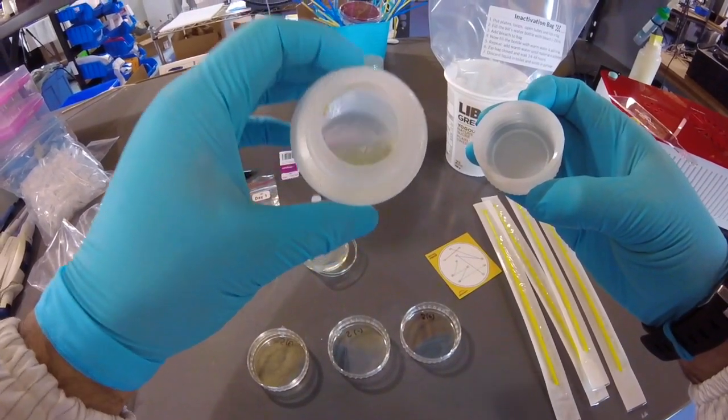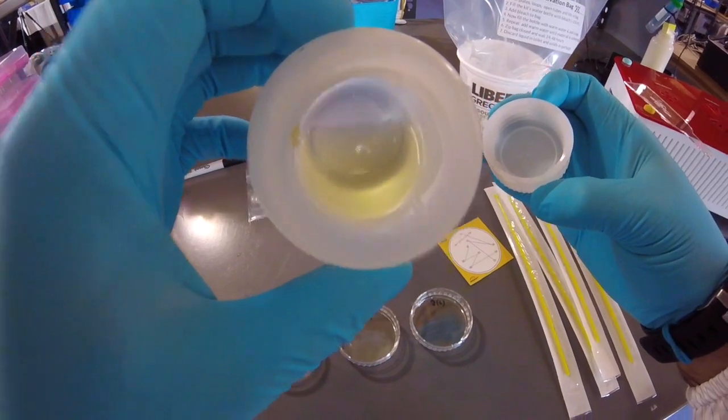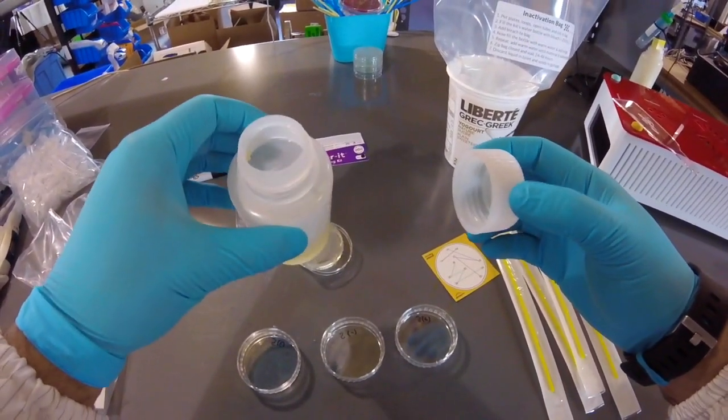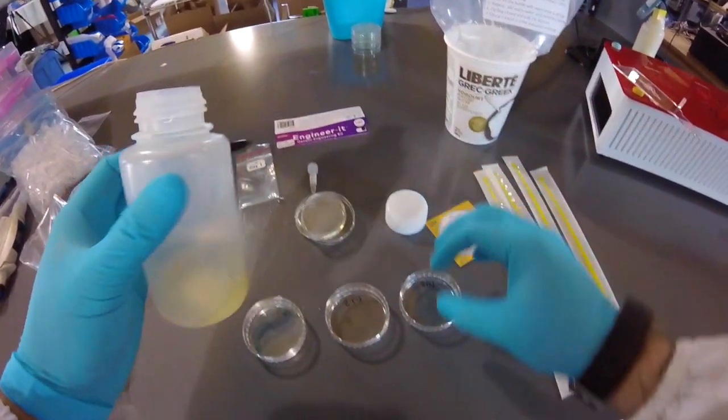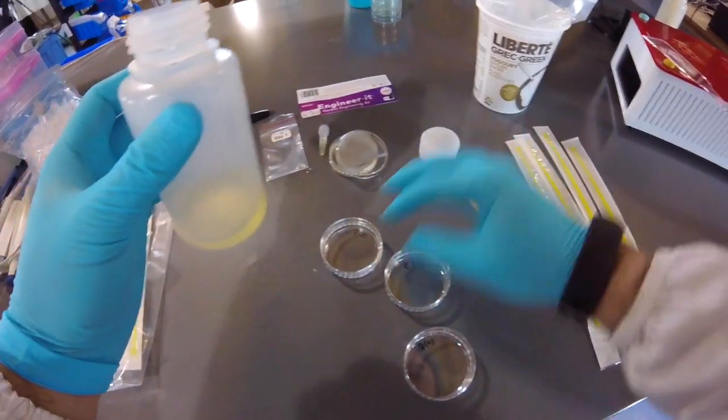So you can see this is pretty much, I don't see any more components. I see a little bit of gelatin capsule floating around. I'm going to go ahead and pour these now. And so same thing goes. You want it about half full.